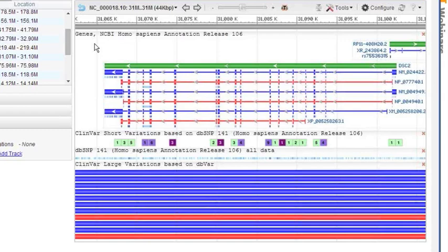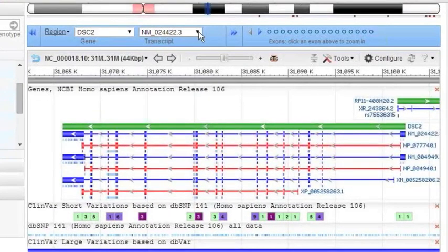Let's use the Gene Exon Navigator to investigate these a little bit more. Notice that now I can see in the Gene Exon Navigator at the top the 3 different splice variants. There are 2 NM type reference sequences that are aligned here. There's also an XM that's based on next-gen sequencing data. I'm going to pick the second transcript here and pay attention on the right-hand side to the Gene Exon Navigator.